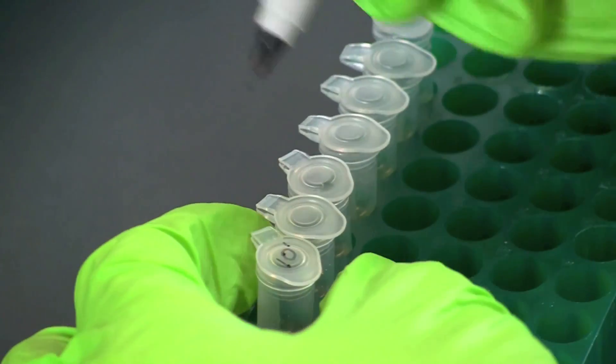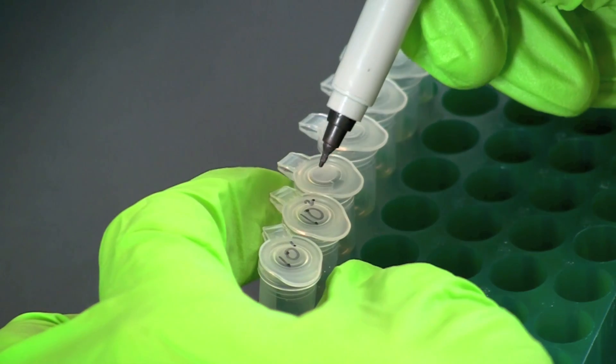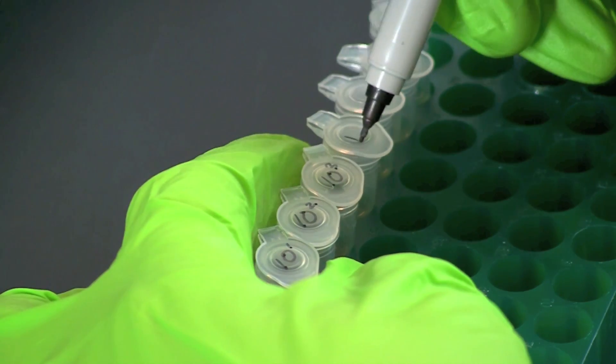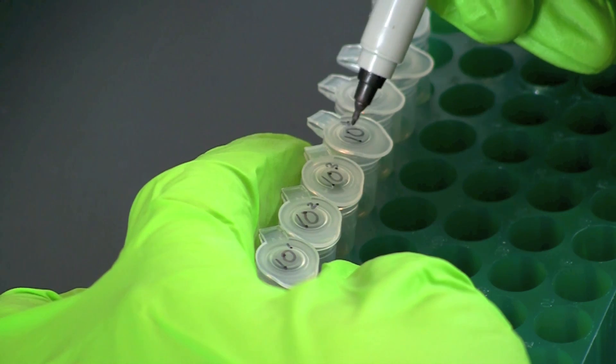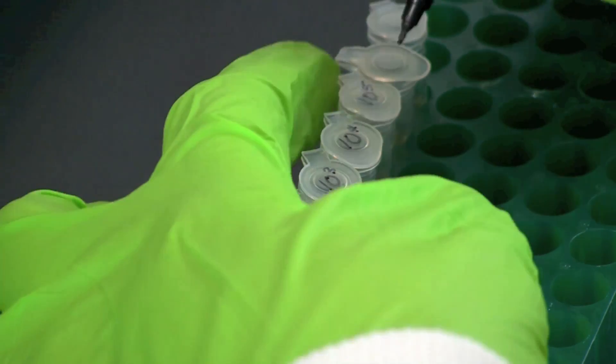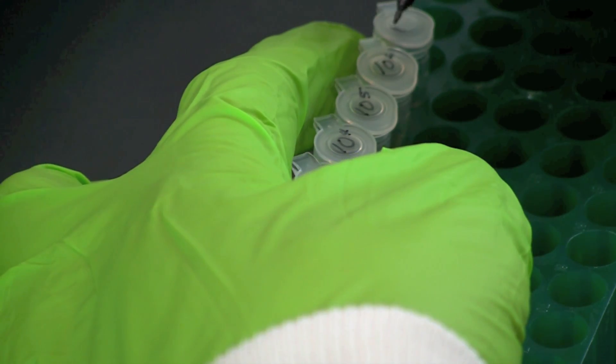Label 7 sterile microcentrifuge tubes with the dilution factors: 10 to the 1st, 10 to the 2nd, 10 to the 3rd, 10 to the 4th, 10 to the 5th, 10 to the 6th, and 10 to the 7th.